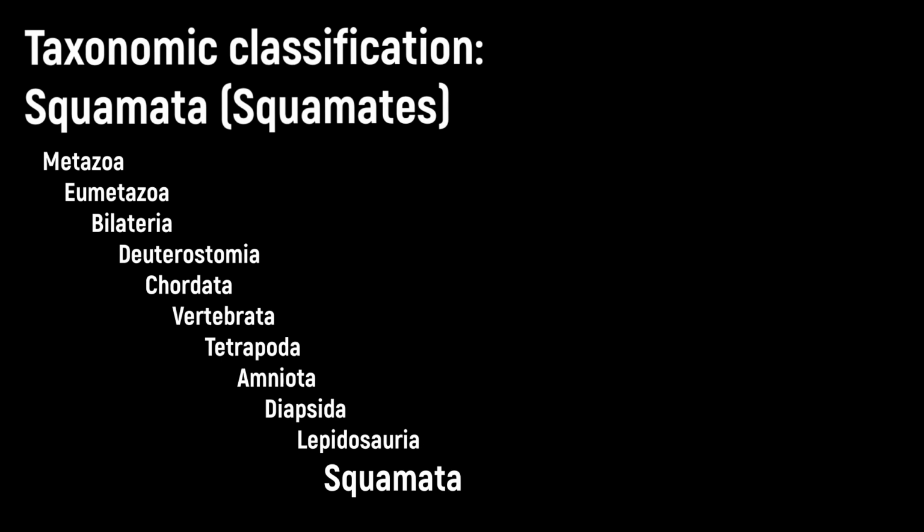The Squamata, or squamates, are a clade of the scaled reptiles, or Lepidosauria, containing around 11,000 species. The traditional terms lizards and snakes are used to refer to various squamates, but are misleading because snakes are phylogenetically nested within the lizards. That is to say, snakes are just one successful group of legless lizards. Numerous other groups of lizards have also independently lost their legs.